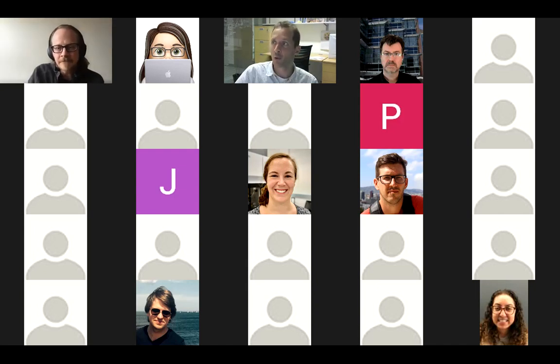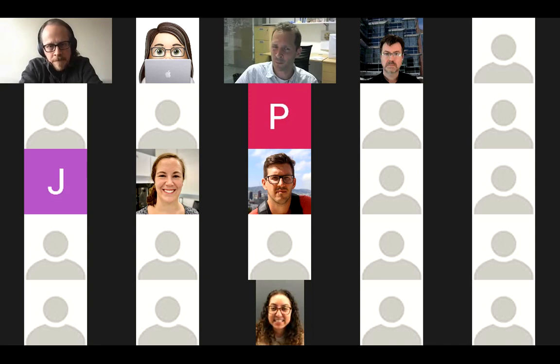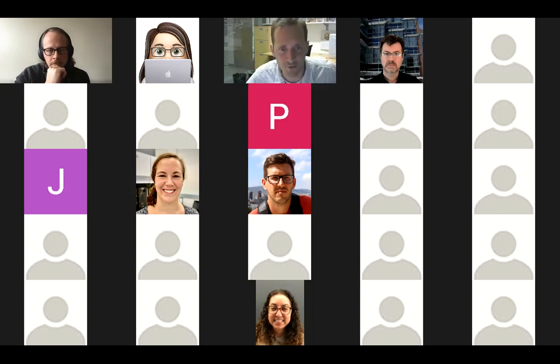Right. So I'd have to check. I think the multiplicity is stored together with the CTF in one file, but I'd have to check the exact implementation with Kino. I would have to look in the code. And then yes, if you have high tilt images, then CTFs are very probably quite poor from the standard type of IMOD CTF estimation or CTF estimation.